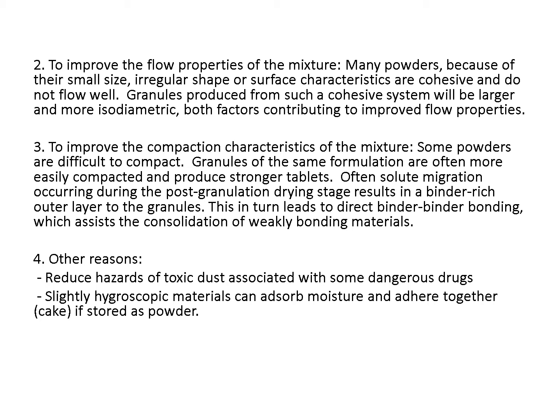Also, the third reason for granulation, the advantages, is to improve compaction characteristics, especially in the wet granulation technique, in which we gather the fine powder and add the binding liquid. It will be the binding powder plus water, and we will form a friable mass or dough, and press it through sieves to make granules. These wet granules are put in an oven.